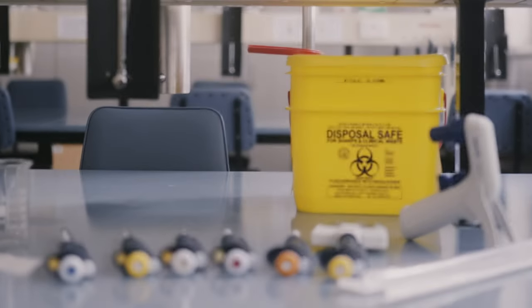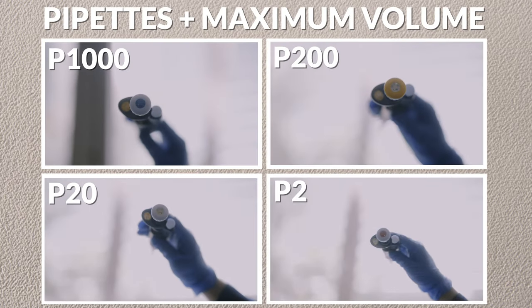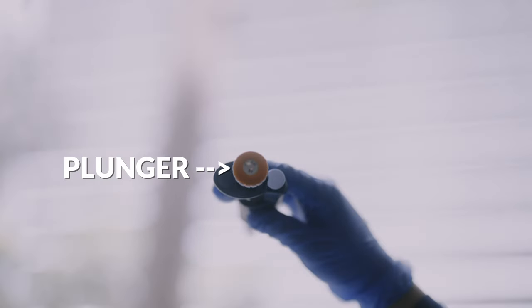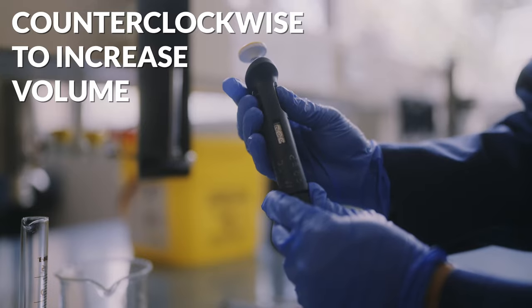Let's get right into it, starting with the range of pipettes, which vary in size and the volume of liquid they can dispense. The P1000, P200, P20, and P2 can pipette a maximum of 1,000, 200, 20, and 2 microliters respectively. These volumes are usually printed on the plunger button of the pipette. To decrease the volume dispensed, turn the friction wheel clockwise, and vice versa to increase the volume.